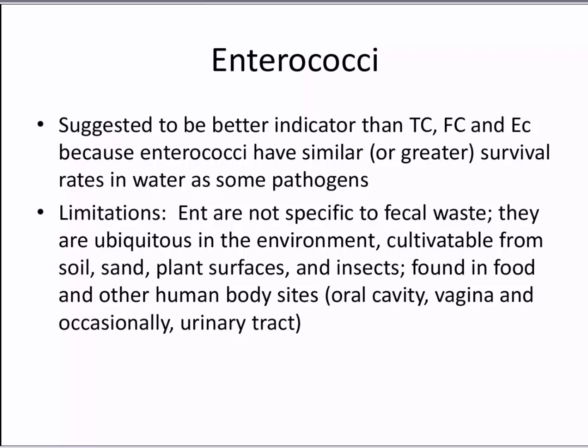However, they're also not specific to fecal waste. They're ubiquitous in the environment. They can be cultured from soil, sand, plant surfaces, and insects. They're commonly found in food and in other human body sites, such as the oral cavity, vagina, and occasionally the urinary tract.